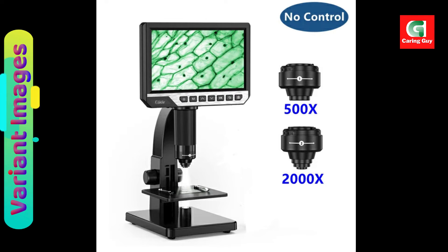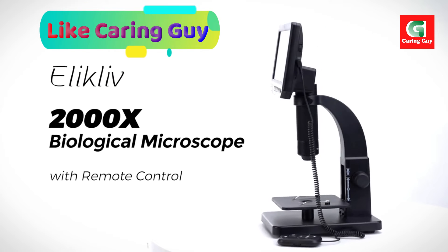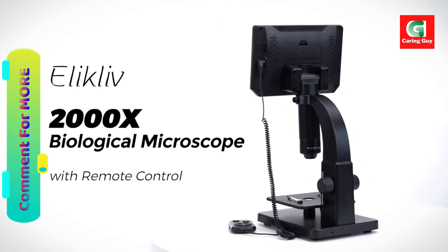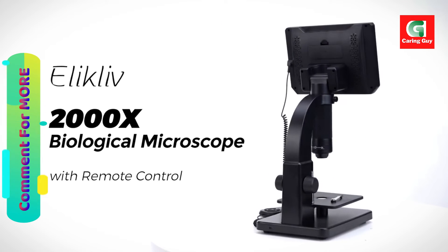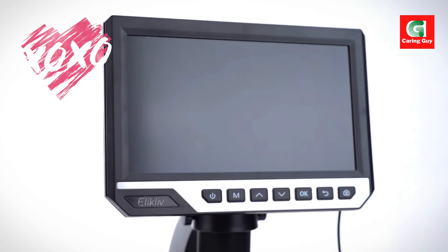To ensure optimal illumination, the EDM11S features adjustable lights. This functionality allows users to control and customize the lighting conditions according to the specific requirements of their observations.